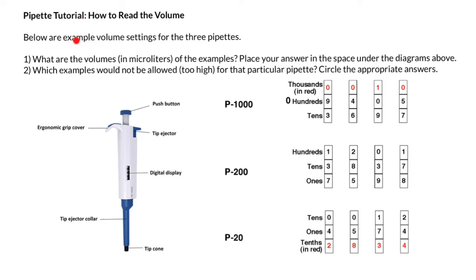Below are example of volume settings for the three pipettes: P1000, P200, and P20. So here's the first question: What are the volumes in microliters of the examples? Place your answer in the space under the diagrams above. And second question: which examples would not be allowed too high for that particular pipette? Circle the appropriate answers.